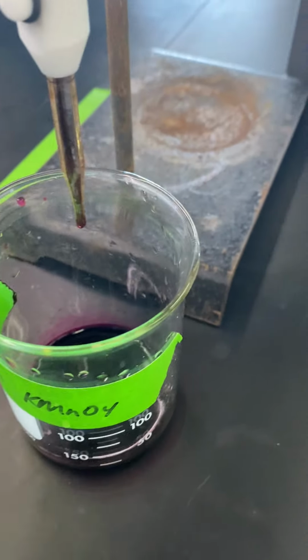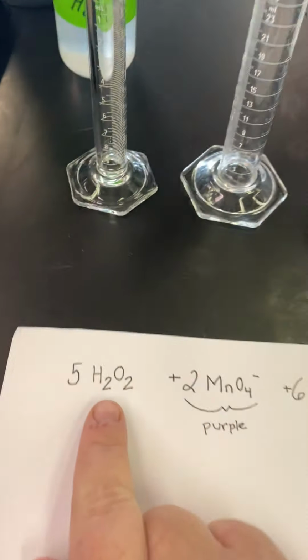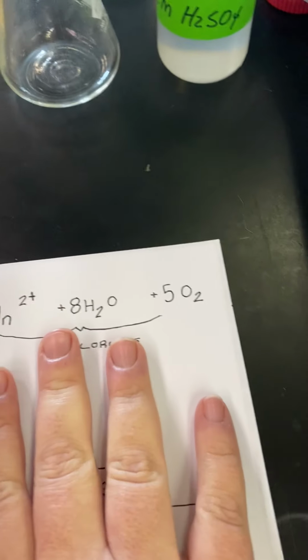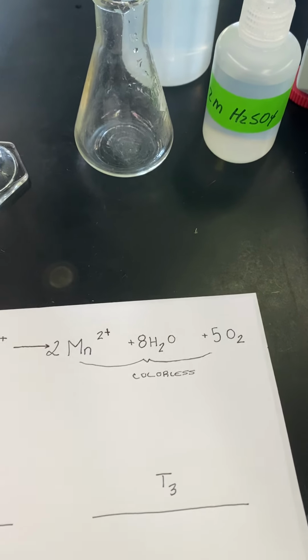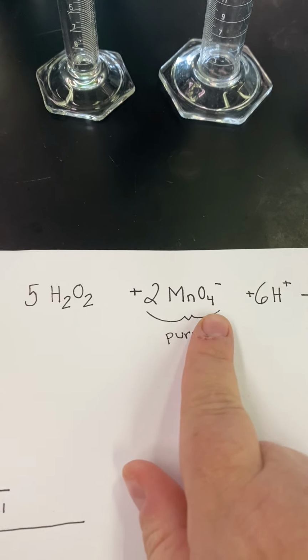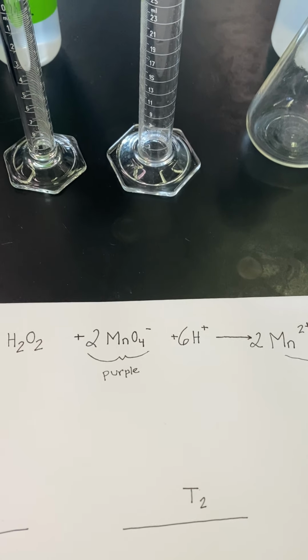Okay, so the background for this reaction, guys, is that we're starting with this purple permanganate, okay, and when it reacts with hydrogen peroxide, it creates a perfectly colorless product. Okay, as long as there's hydrogen peroxide in our reaction, the purple permanganate will react and will form a colorless product.